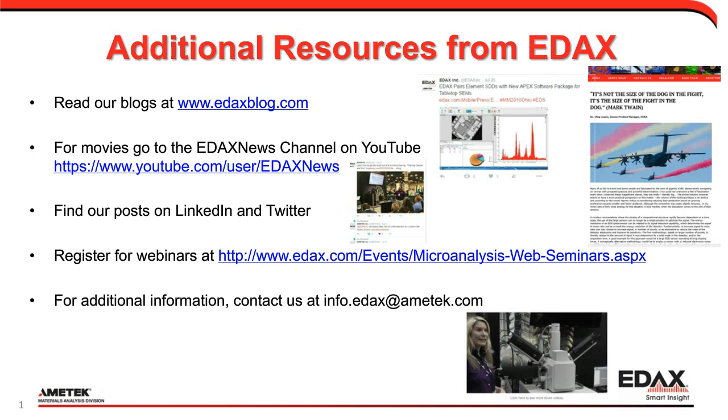And just to recap, the optimum dead time for an EDAX Octane detector, we would typically advise in the 10 to 30% range, and with the Octane Elite, we're looking at the lower than 10% range.